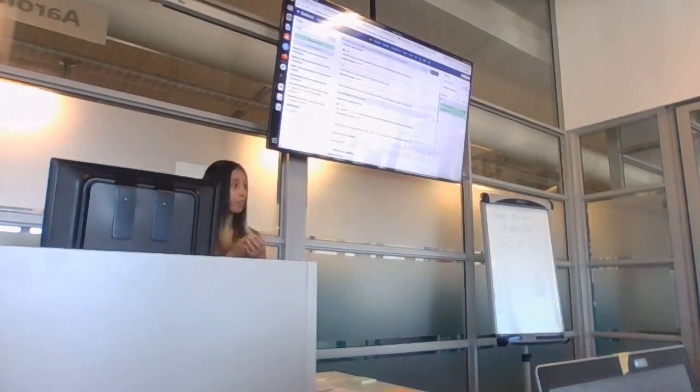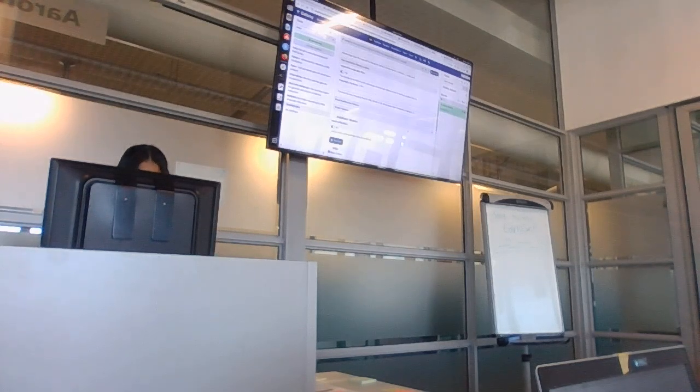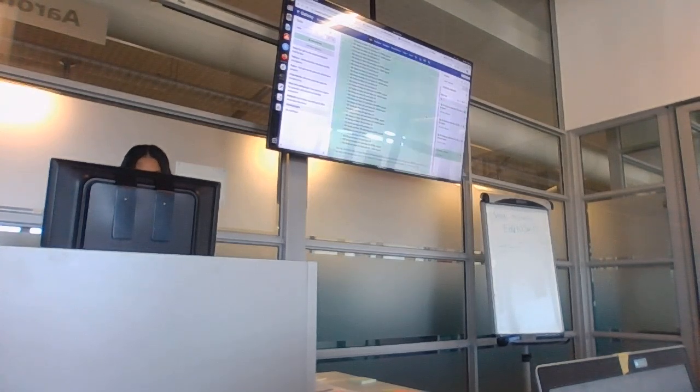Now, normally, you don't need this to also be in JSON format. You can understand the HTML report, but because we're going to put this into MultiQC, which requires a JSON format, we have to select this to yes. We change this to yes for the next part of this. When you're done with that, you can click on Run Tool. And you will see it will create an HTML report and a JSON report.